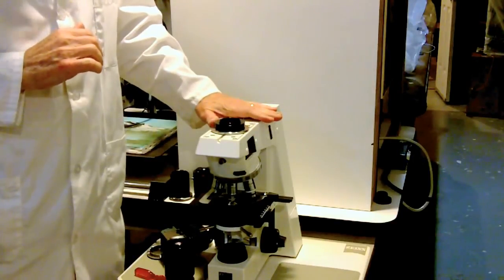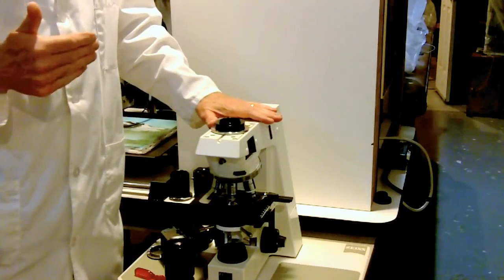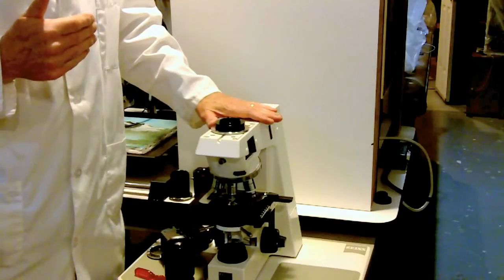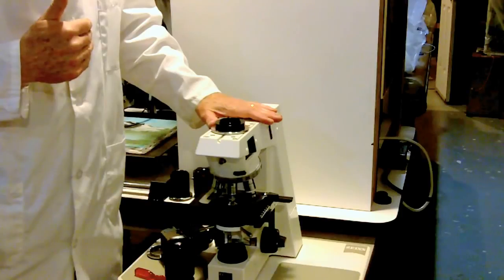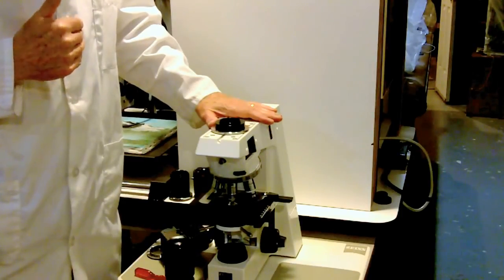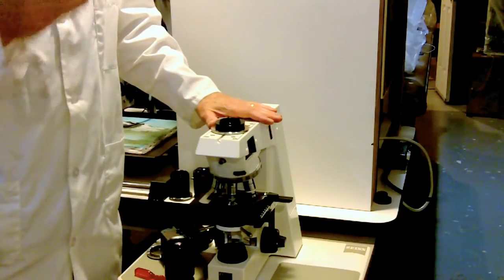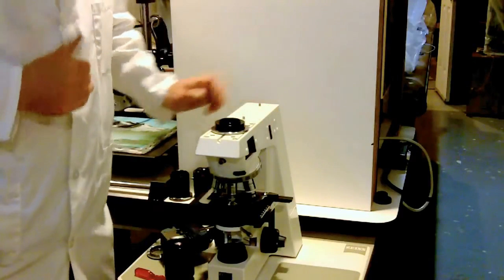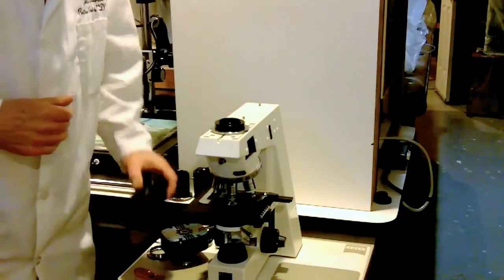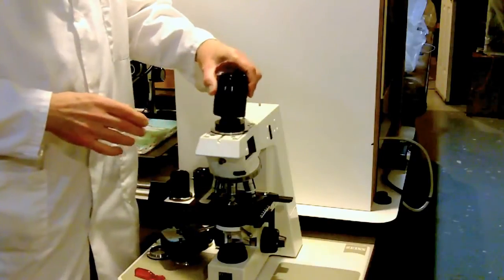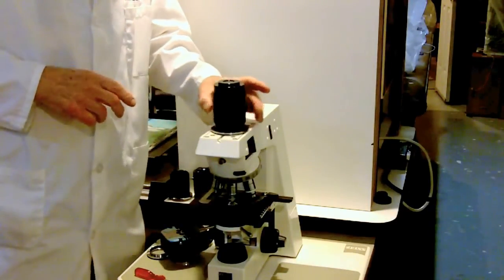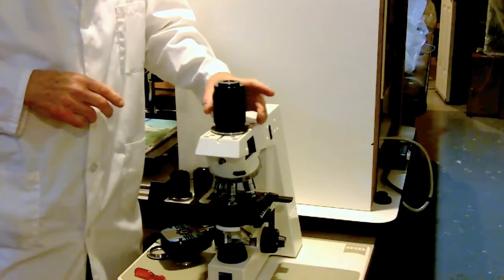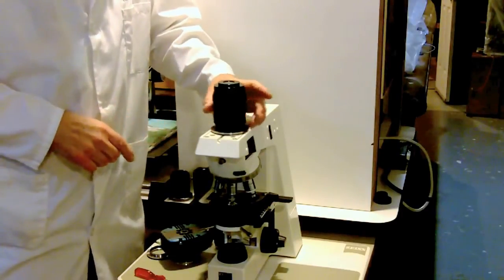And we can do that by getting them prepared properly by a good microscope mechanic. We can add LED illumination to these old microscopes, we can add new optics, and now we can add the InFocus module that again replaces the trinocular body tube. It simply screws onto this adapter we put in place.